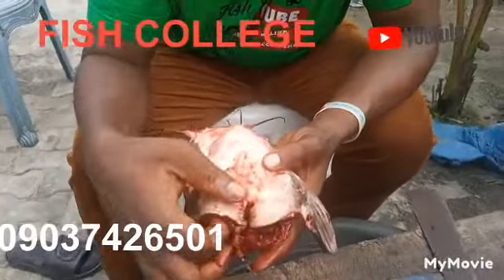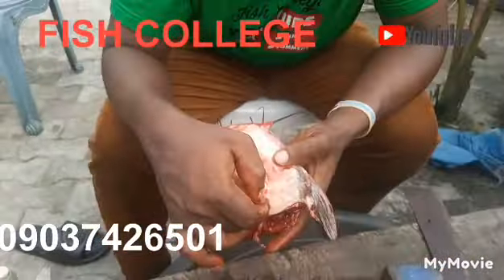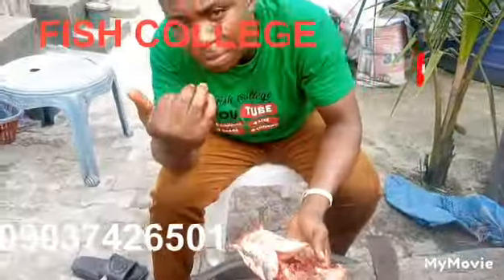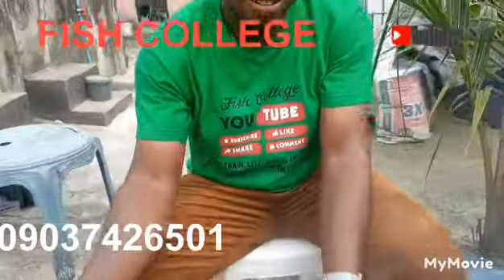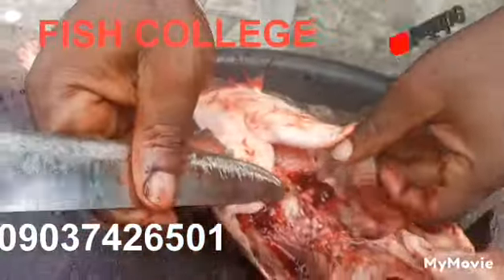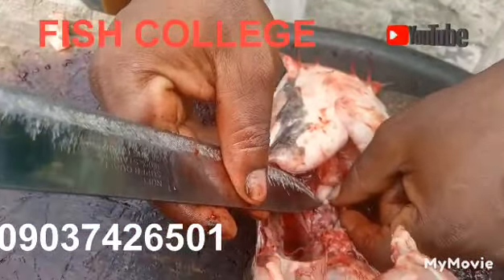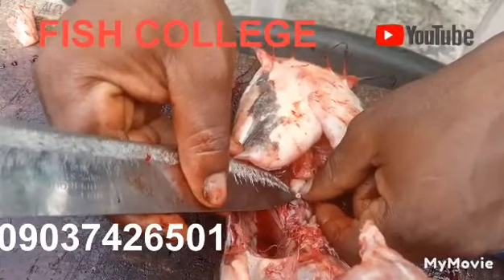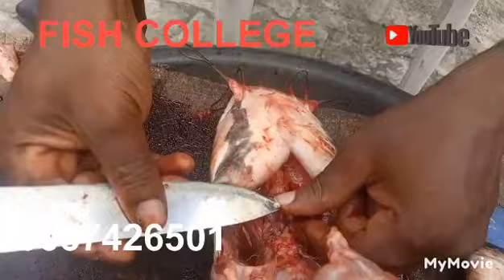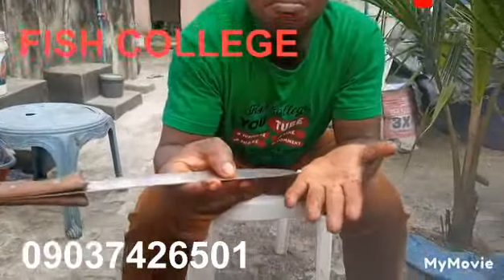Can you see? Remember, these are the scars of the suturing points. It's very, very tiny. This is it — this is what we call the master gland.